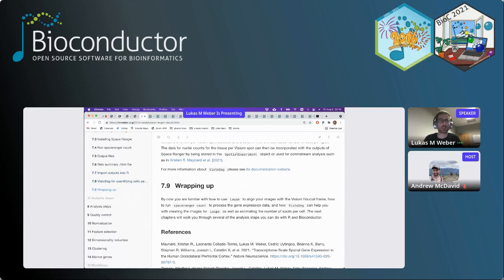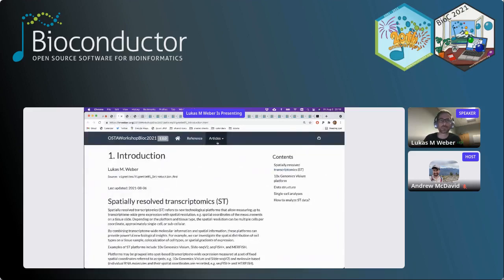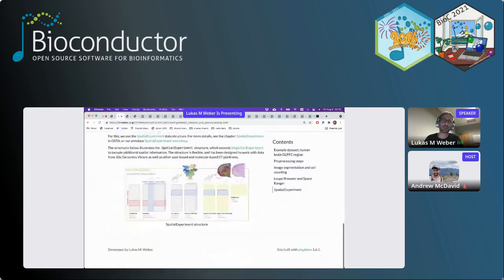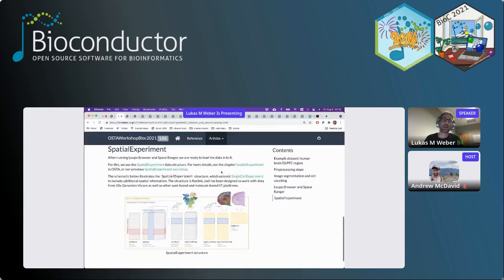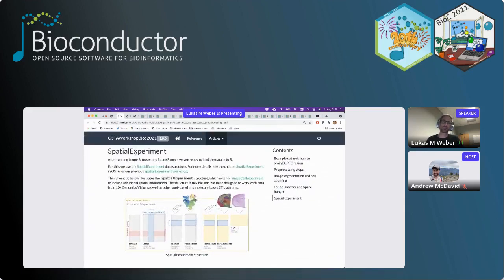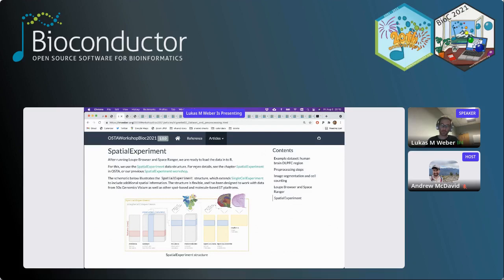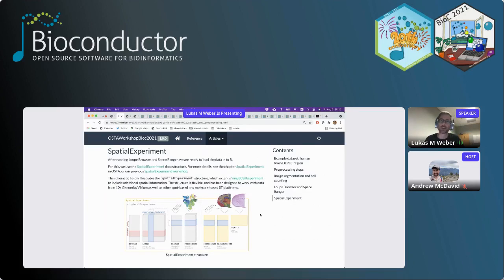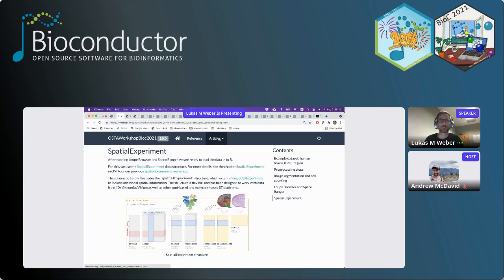After running Loupe Browser and Space Ranger, we load the data into a spatial experiment object. This image gives an illustration of how that is structured. We had a separate workshop on spatial experiment itself. Essentially, it's extending the single-cell experiment structure for spatial data with additional structures to store the spatial coordinates and spatial metadata, including image information.